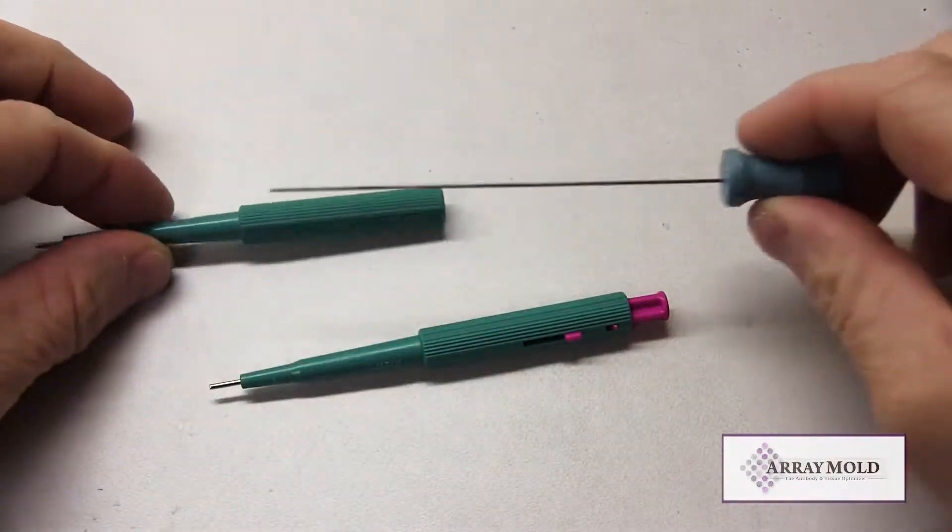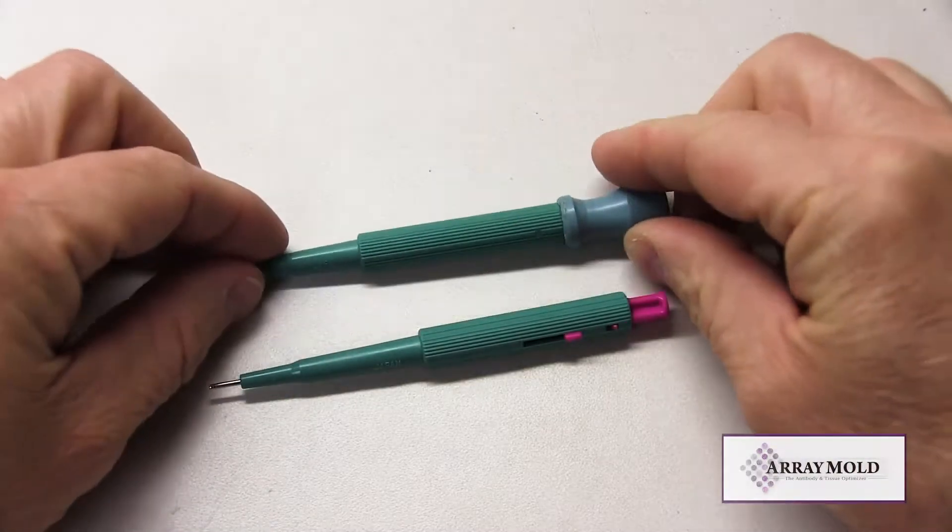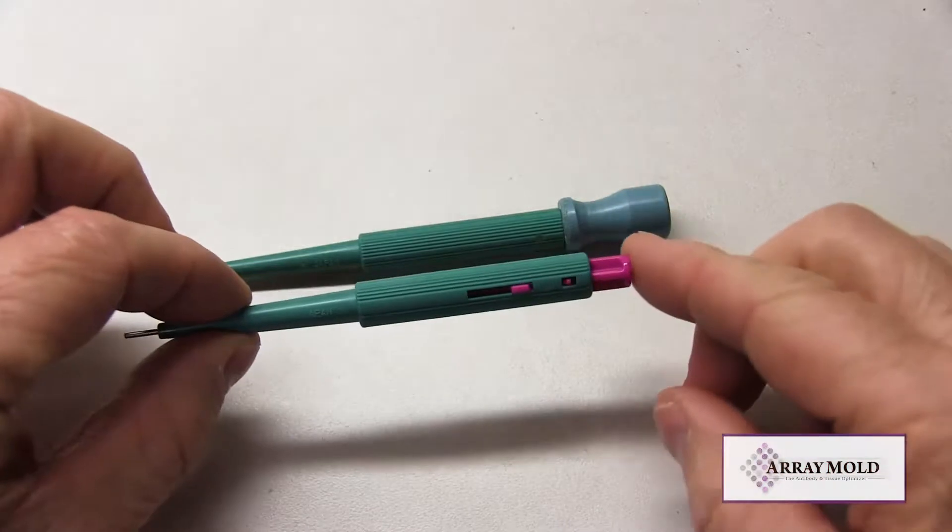The array mold tissue microarray instrument uses the needle without the plunger. We have added a stainless steel stylet for extracting tissues from the needle.